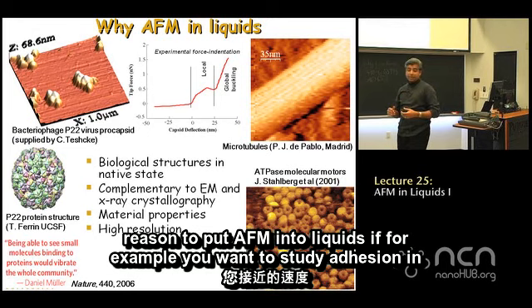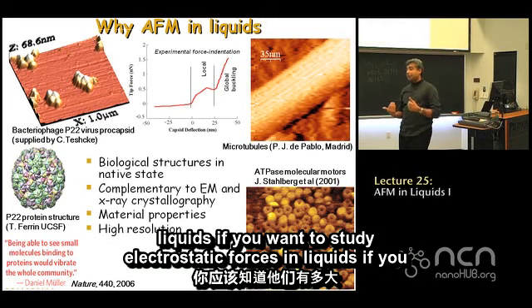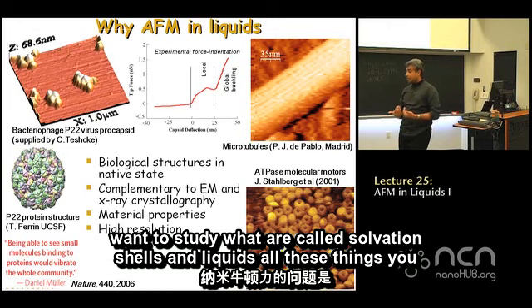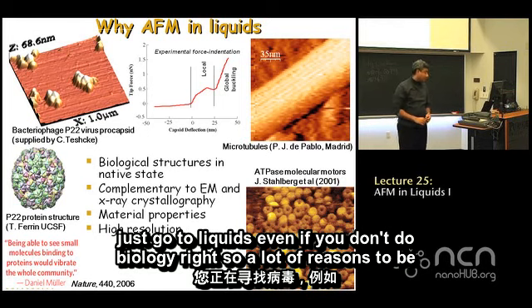If, for example, you want to study adhesion in liquids, if you want to study electrostatic forces in liquids, if you want to study what are called solvation shells in liquids, all these things, you just go to liquids, even if you don't do biology, right? So there are a lot of reasons to be doing things in liquids.